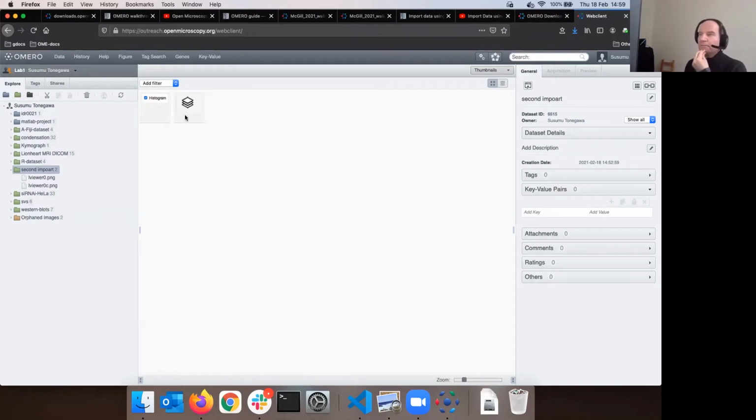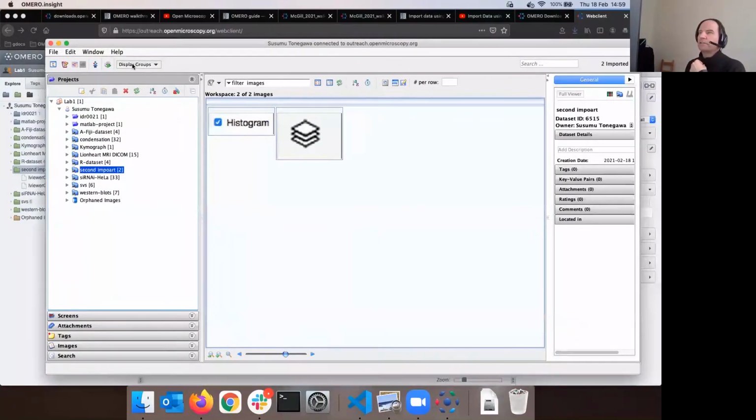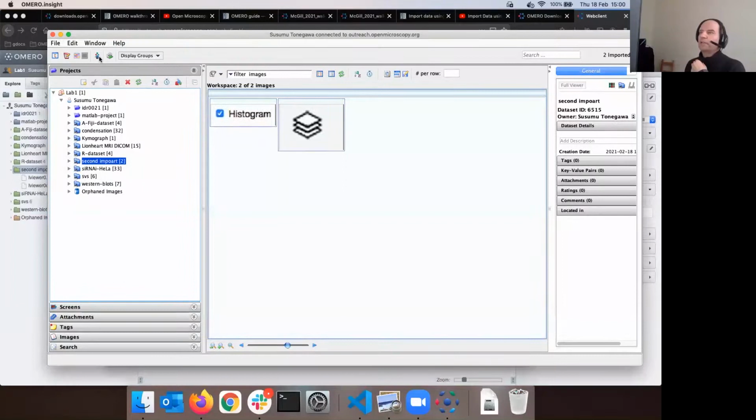And I can now do a second step. I can import for somebody else. Okay, I'm back in OMERO.insight. You cannot do that. Just trust me that this is possible. You can play with your own imports, creating new data sets and projects as you see fit. Okay, and without importing too much. We warned you about that. Just explore the various formats, etc., and see how it goes for you.